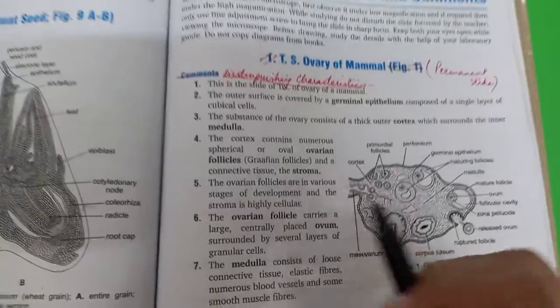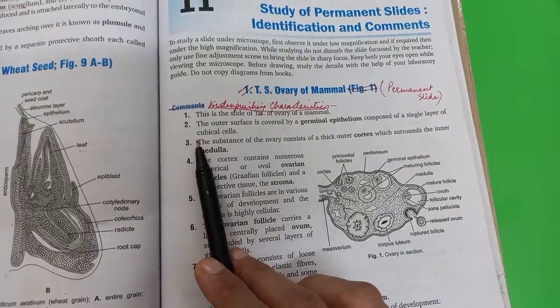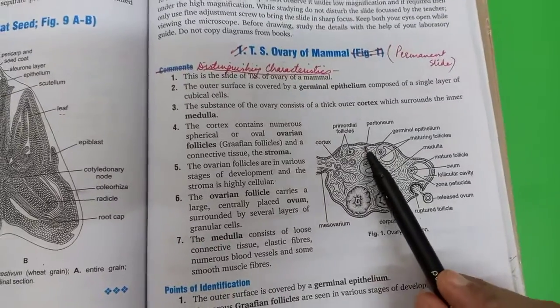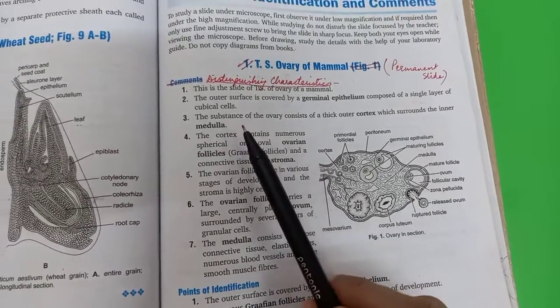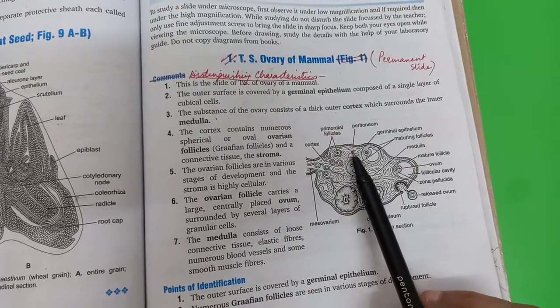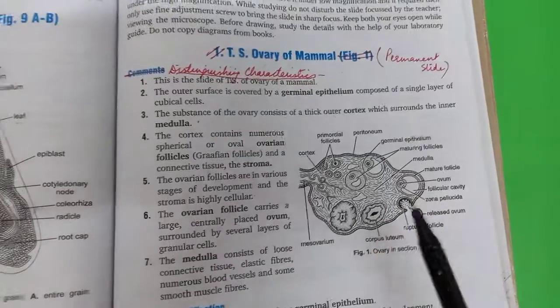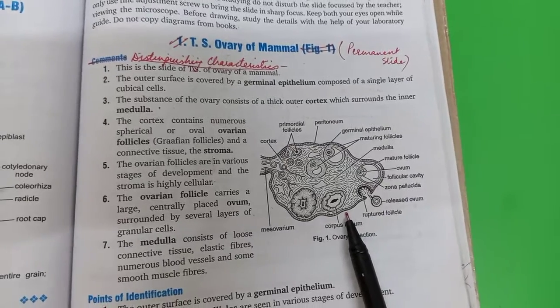The first point is, this is the slide of TS of ovary of a mammal. Second, the outer surface is covered by a germinal epithelium composed of a single layer of cubical cells. So this is the outermost layer, children. Third, the substance of the ovary consists of a thick outer cortex, which surrounds the inner medulla. I have recently completed this topic in theory, so I hope you have understood the structure of the ovary. This is just the same in the practical slide.